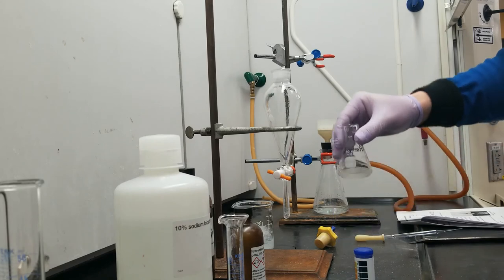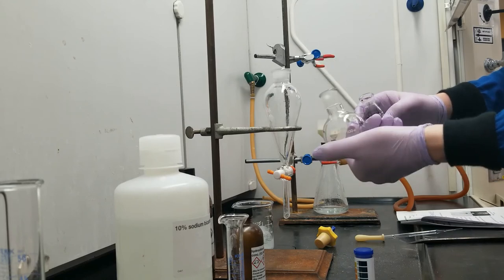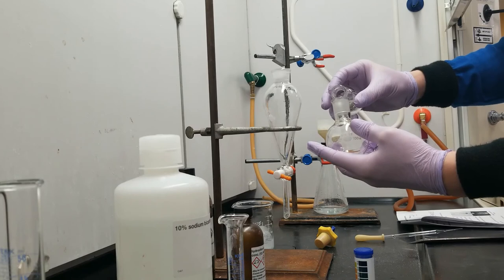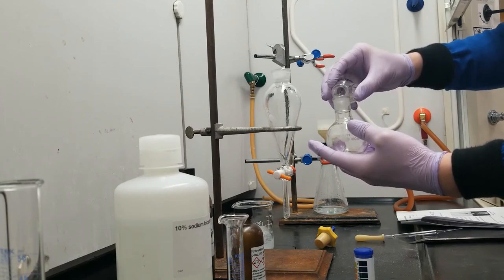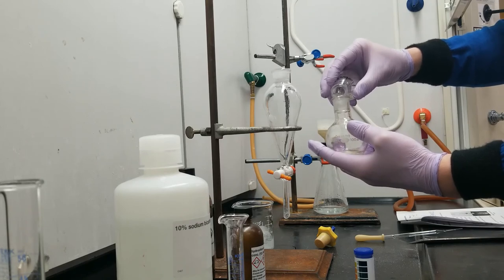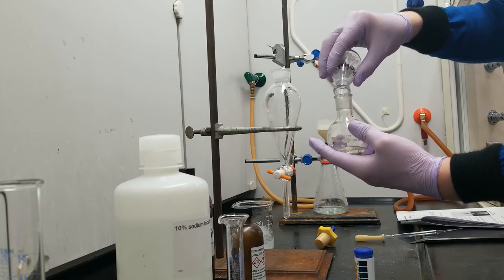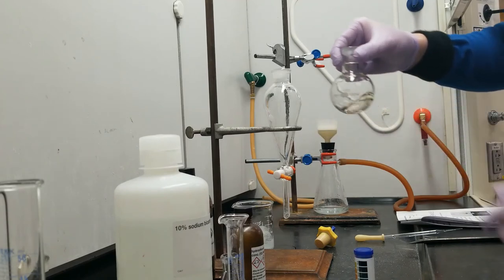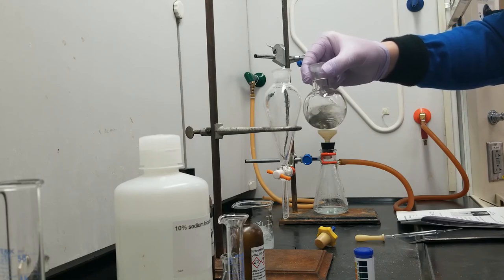So now I've got a nice dry organic layer packed with acetanilide. Let's go ahead and transfer it to my pre-weighed round bottom flask that can go onto the rotavap. And I'm just going to decant, leaving the solid behind. Almost made it out. Ta-da! So I'm going to take this over to the rotavap now, and let's remove the diethyl ether and see how much acetanilide we have.